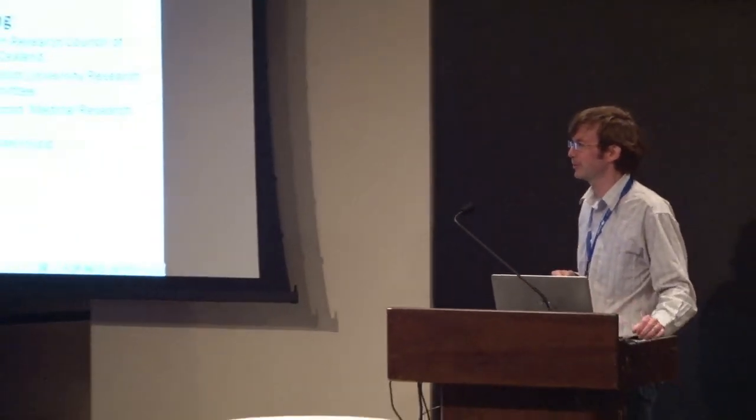It's just really frustrating to see lots of biology groups who use proprietary software that's sometimes very poor and that has huge claims. I see people using things like Amira and stuff like that. And that's why I tend to write everything I want to do. It finds its way into here eventually. So I'm more a user, but I'm a user that doesn't trust Amira or all these proprietary image processing software packages.